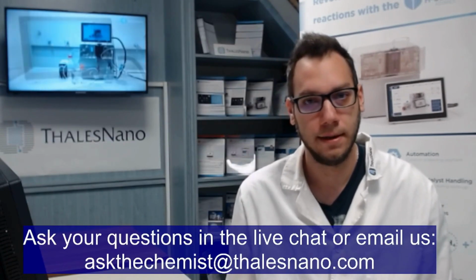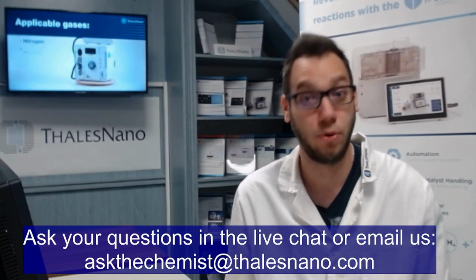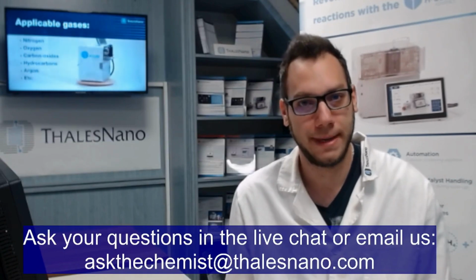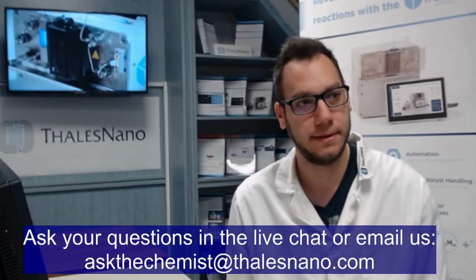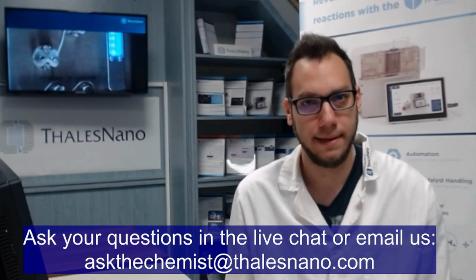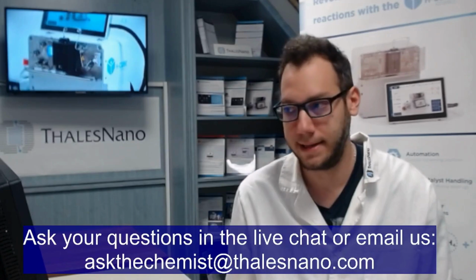autoclave. There is a small limitation with the time factor because the instrument generates 70 milliliters of hydrogen gas per minute, normal milliliters. So that's quite a low amount compared to the volume of some autoclaves. So if your autoclave is approximately 500 milliliters or maybe a couple of liters, there could be a couple of hours needed to fill the headspace of your autoclave if you want to use it at fairly elevated pressures, such as, for example, 50 bars would take a couple of hours to fill, but it's perfectly possible to arrange that.